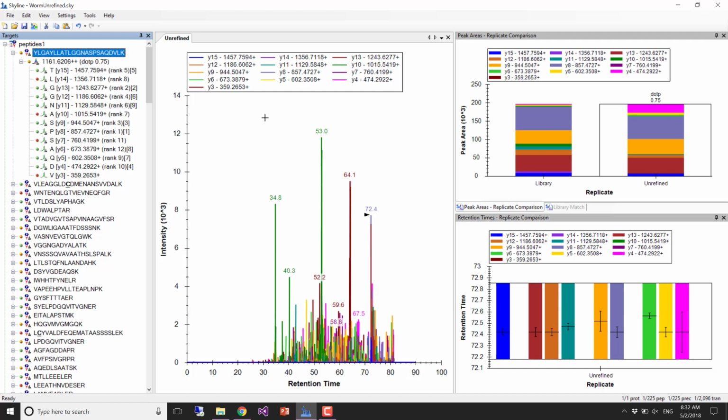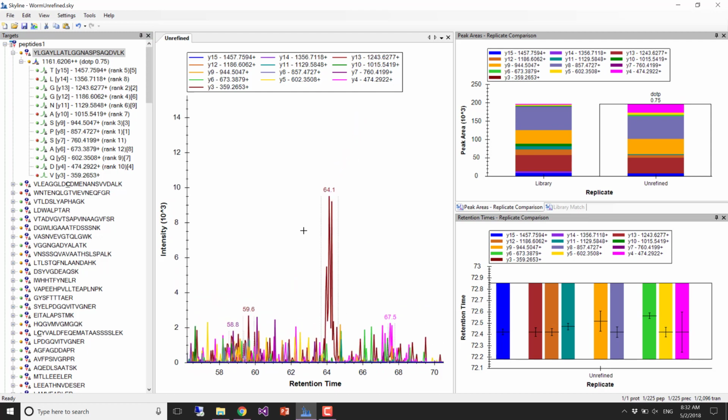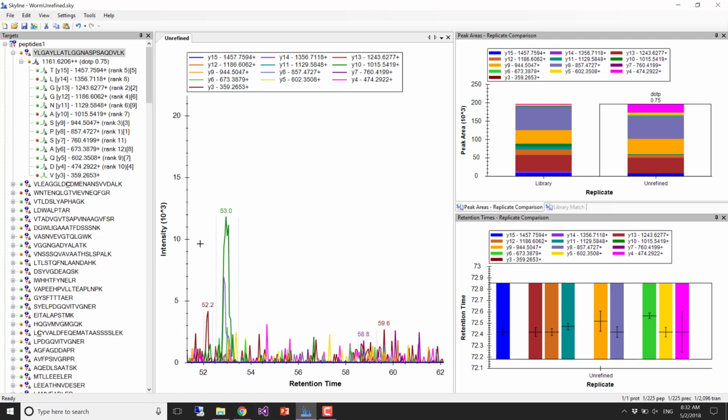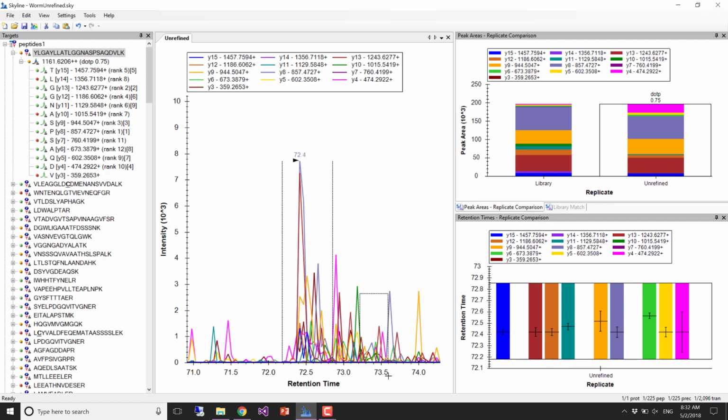And so that's the rest of the data. Like you could consider zooming in and looking at some of these other large peaks. But what you'll find is most of them have one or two co-eluting transitions. And Skyline's really done an okay job at picking the most probable thing where there's a bunch of stuff, but it's not really a nicely co-eluting peak, I would say.